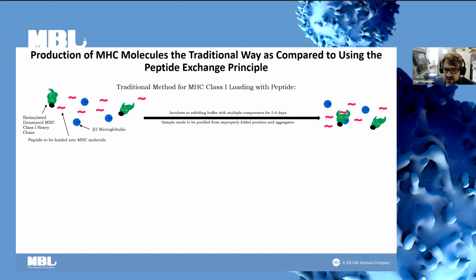This delay does not allow for changing your experiments based on intermediate results, and requires the researchers to know exactly what peptides loaded in what MHC alleles are necessary for the experiment before it even begins. The addition of every new tetramer will significantly increase the cost of the experiment, and it will also leave behind a lot of unused tetramer when you're done.